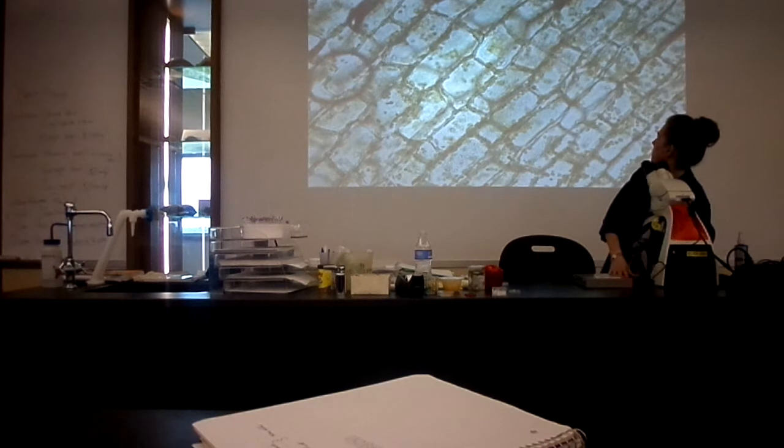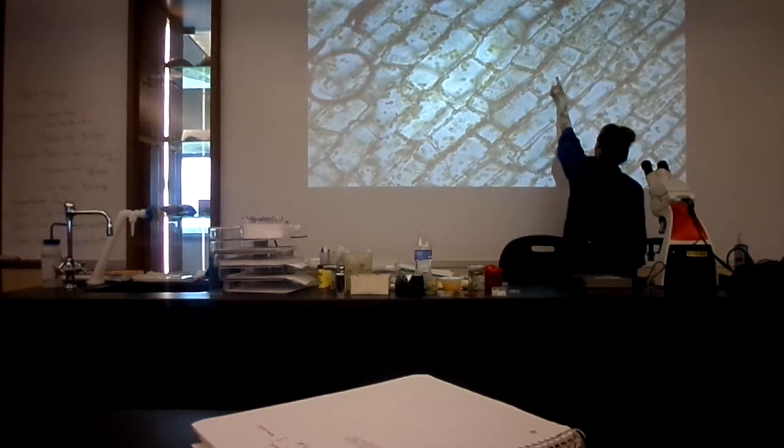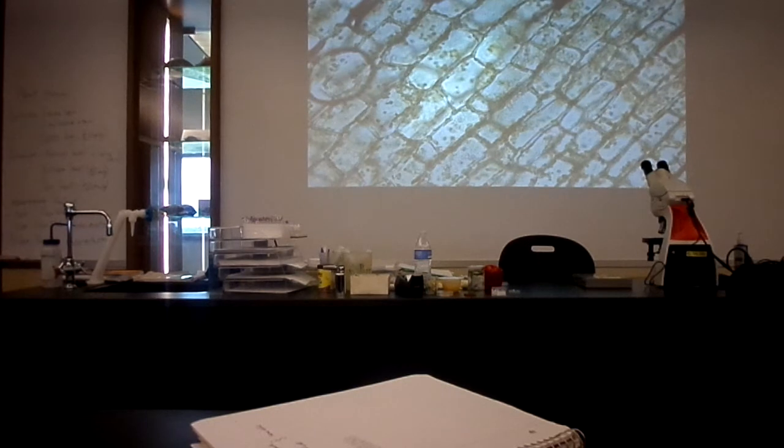Here, where is it? Okay, here, although he's not moving, right there's a nucleus of that cell. And so we've got some good cytoplasmic streaming going on there too. This is not something that in 1406 we look for, but we don't see it very often. Here we see it, and it's pretty good. Anybody else is moving? No? Nobody else is moving? Okay. Any questions?